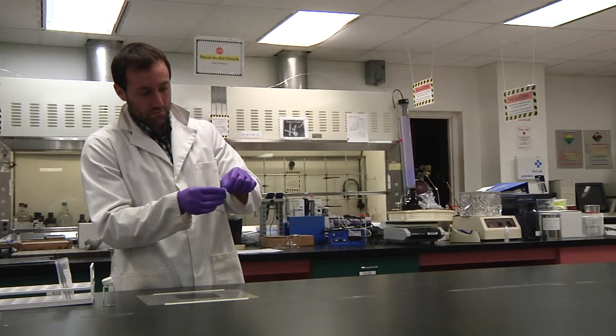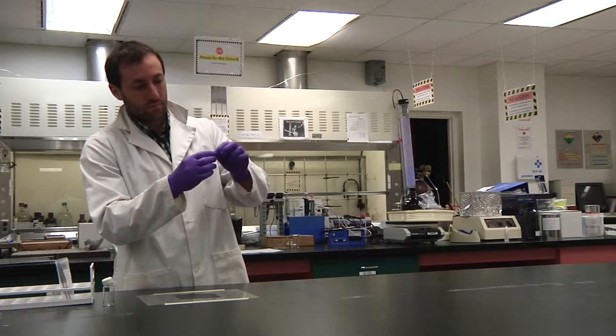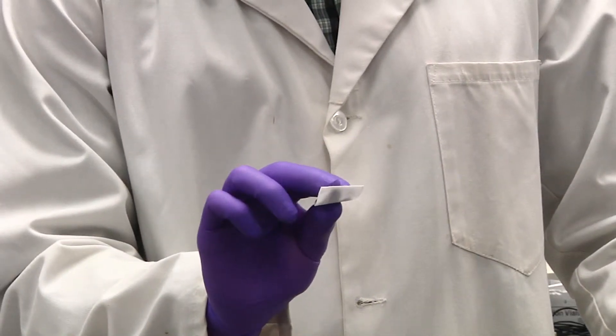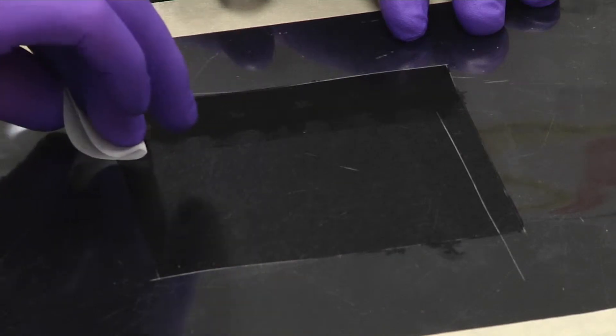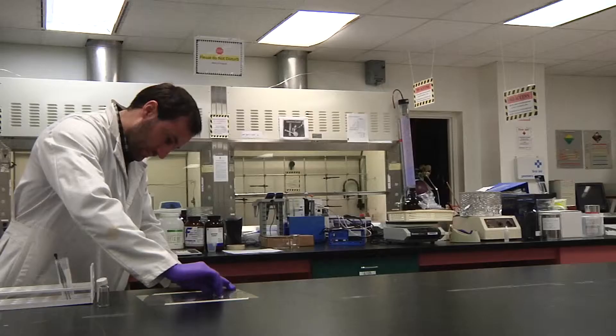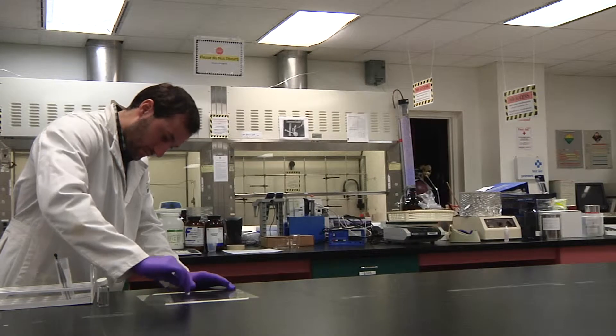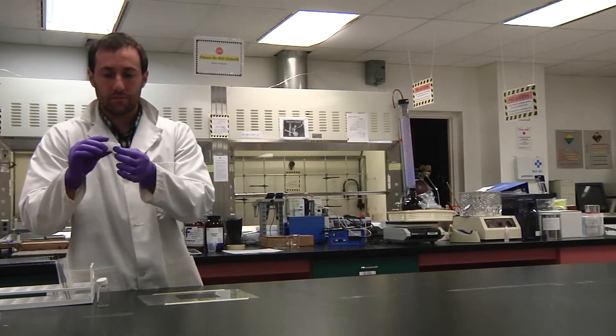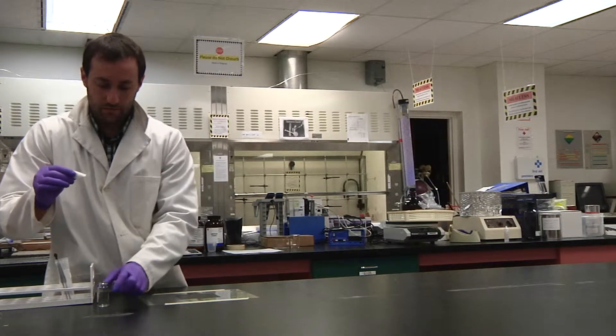Then carefully fold the wipe so that the wiped area is on the inside. Try to minimize touching the wiped area. Wipe the surface again, this time going from left to right, progressing from bottom to top. Finish with one last wipe down the right side of the template, picking up any residual solvent from the left to right wiping.